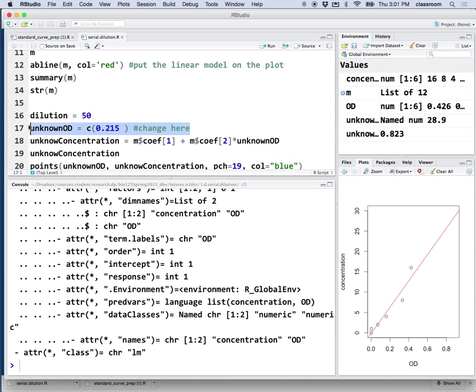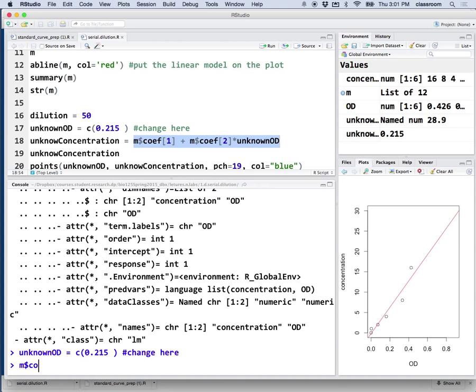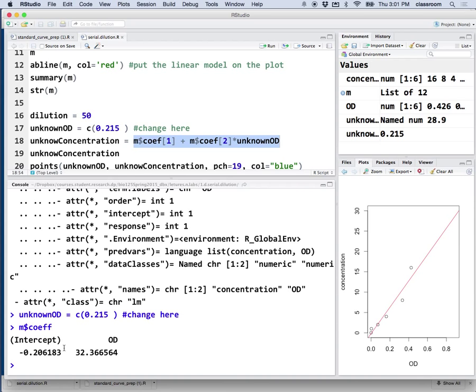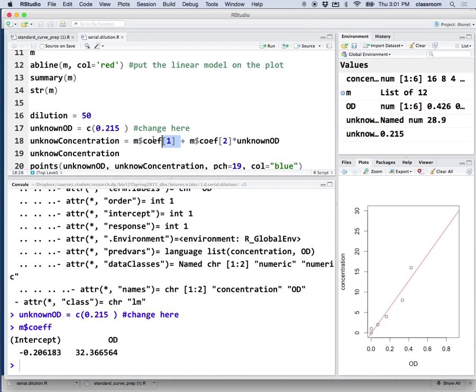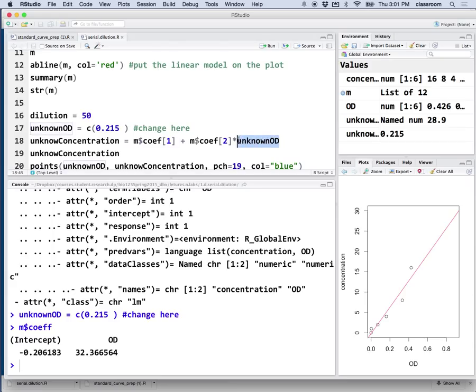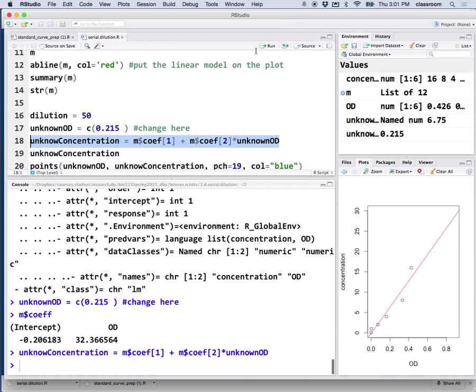Here's the unknown. The unknown had the OD of 0.215 for this group. The M coefficient, that's basically the first one is the intercept. The second one is the slope. But, what I want to find out is the Y value for the unknown. The unknown OD. So, I put the unknown OD, which is X here. And then, what I got is the concentration for the unknown. I highlight this line. Run. And that's it.